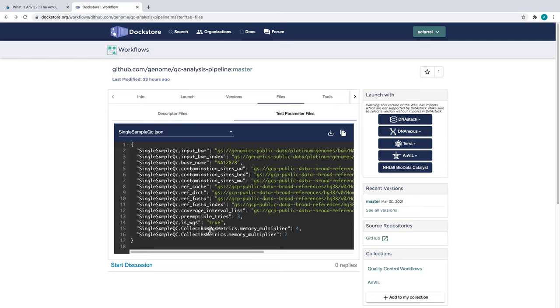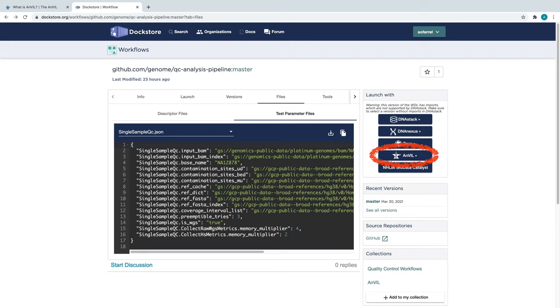This JSON is what we will use to run this workflow on Terra, Anvil's compute platform. With that in mind, let's head on over to Terra. On the right side of the screen, you will see a button allowing you to launch with Anvil. This button will appear on any workflow written in workflow description language that is hosted on DocStore.